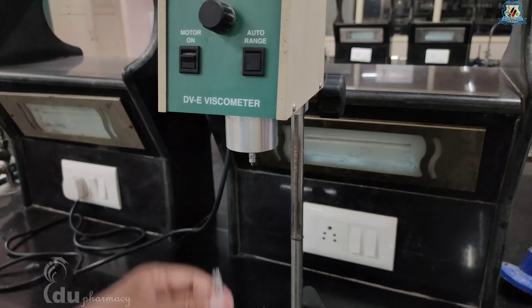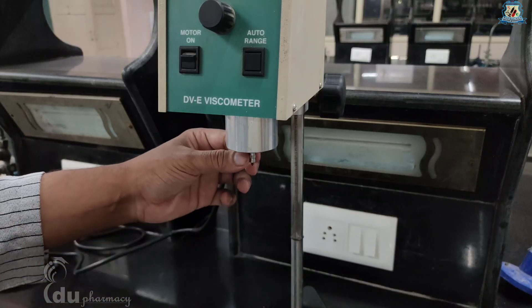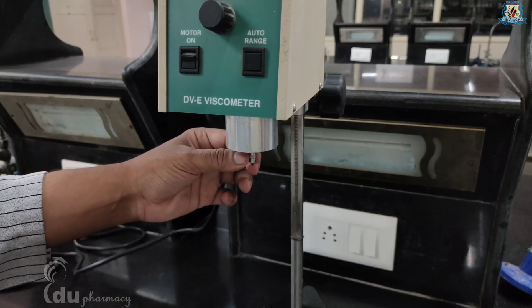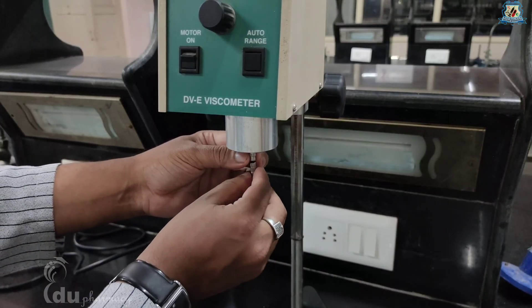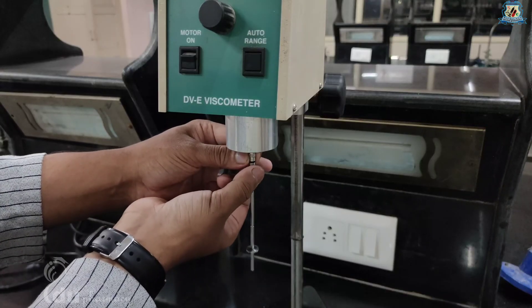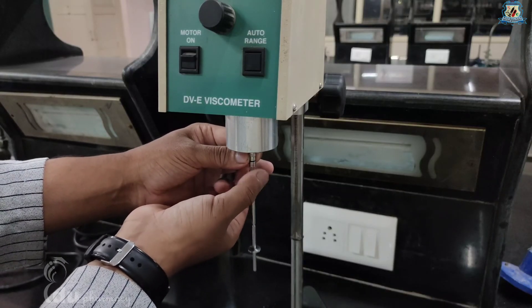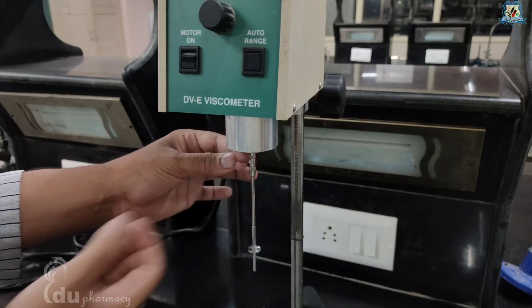Spindles are attached to the viscometer by screwing them to the male coupling nut. To attach the spindle, slightly lift up and hold the coupling nut, then screw the spindle clockwise. Be sure that the motor is off before attaching the spindle.